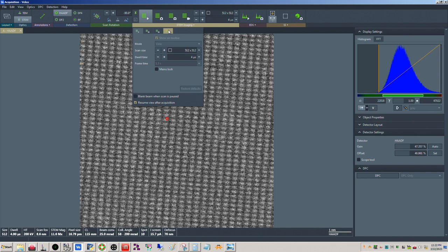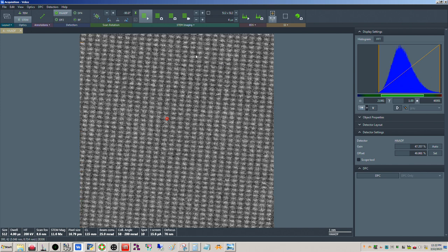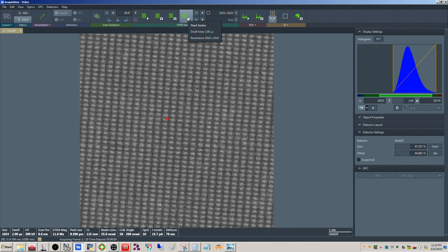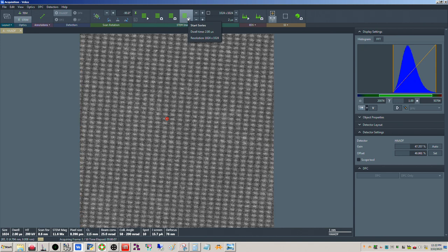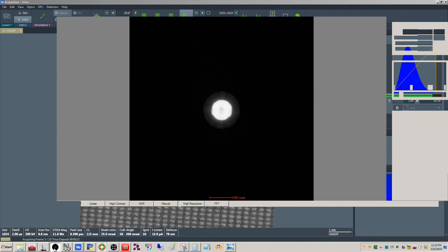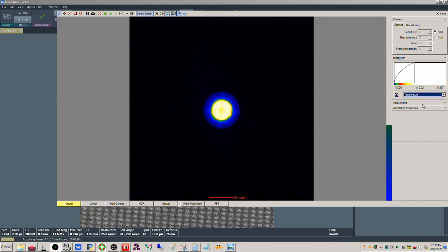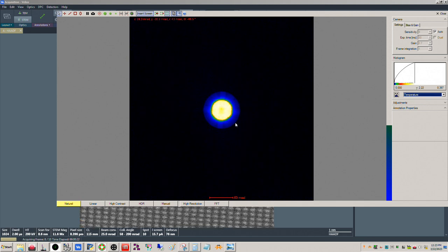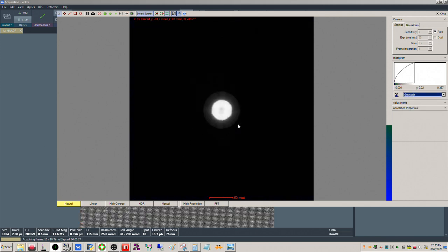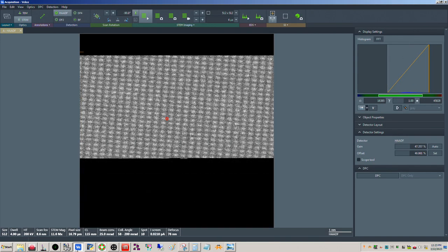All right, let's try series acquisition. So do 2 microseconds and 10 frames. Nice thing about doing this is it has like a noise smoothing effect when you integrate the frames. I mean, this looks basically okay. It might be off a little bit. It's very critical that your zone axis alignment is good when you do this. So if this is off by enough, it can impact you. So let me blank.